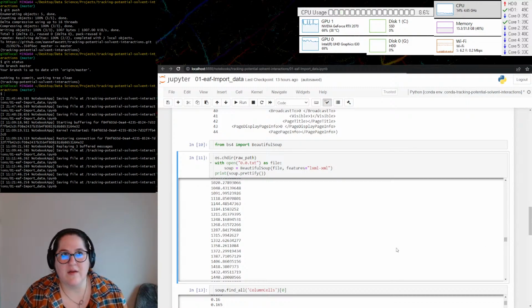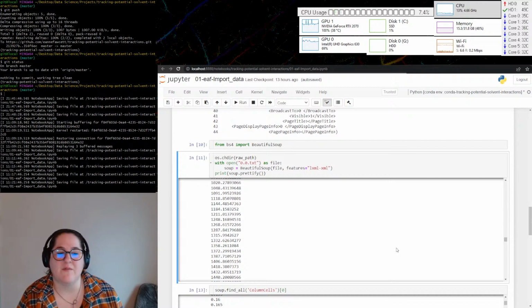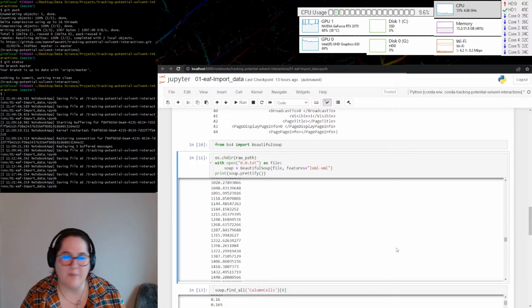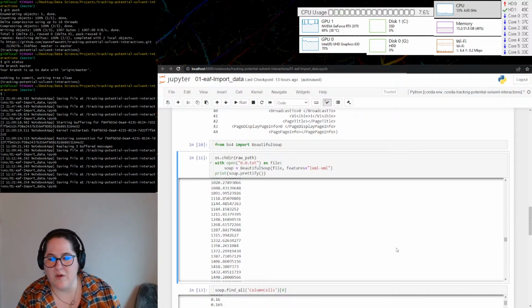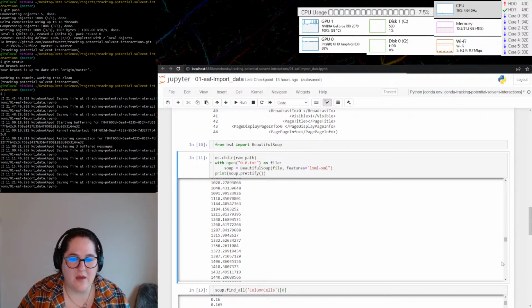So I know as a scientist, I want this graphed, right? I want to look at the graphs. I want to be able to interpret what's going on and find my peaks. And if I can find my peaks, then I can get some information about composition, right? So the whole point of this particular project at the time was to develop a standards curve. So I want to see at what point and how the peak shifts based on concentration level.